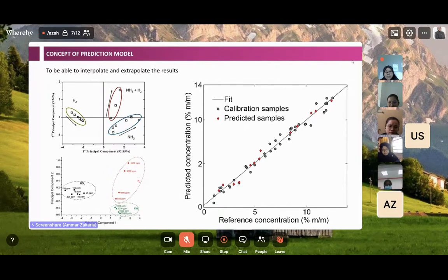When we have a result out of range, you need to make sure that the range is valid, right? Somehow it could be due to other noise, skew, or so on. You need to be careful. Normally, I would suggest we should interpolate, not extrapolate the result. Once you manage to reach this area, I think you are almost there.